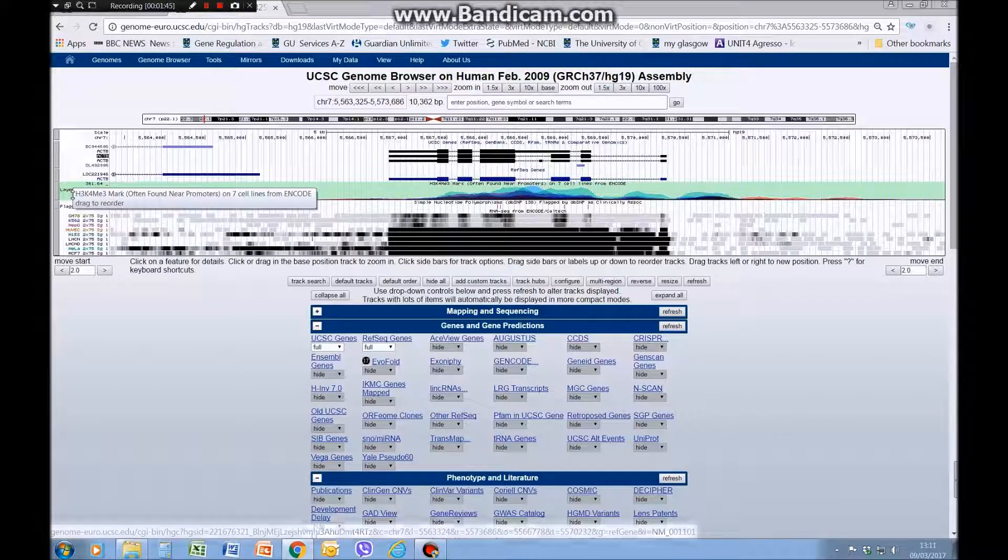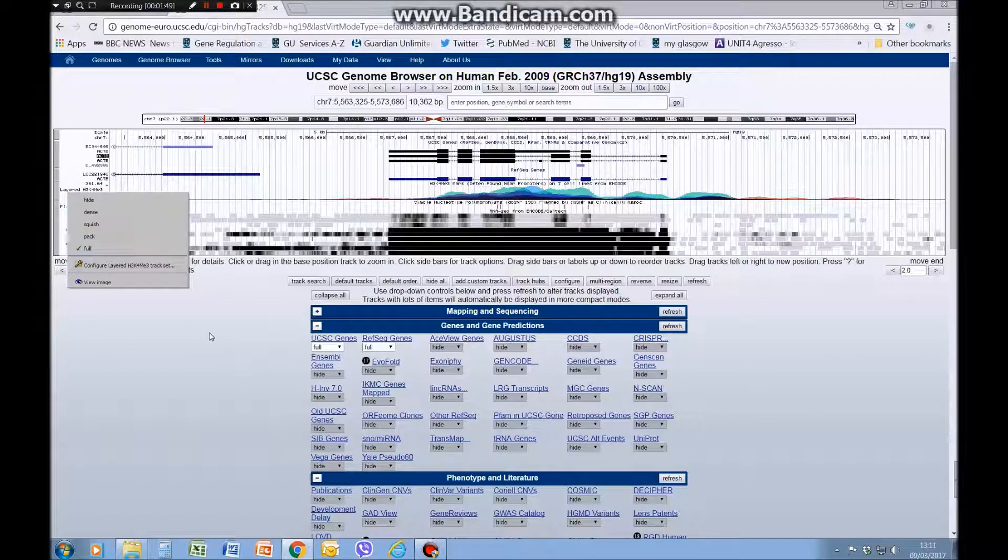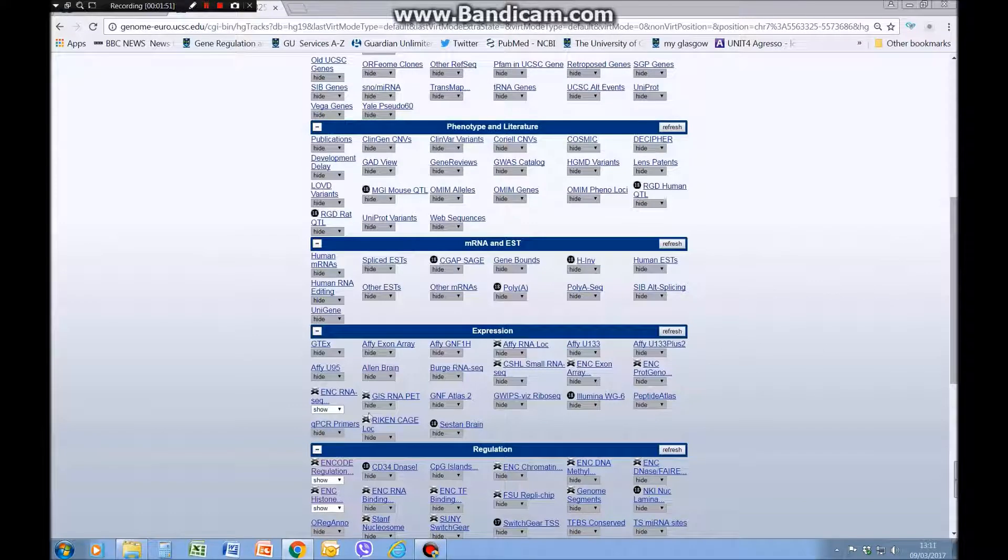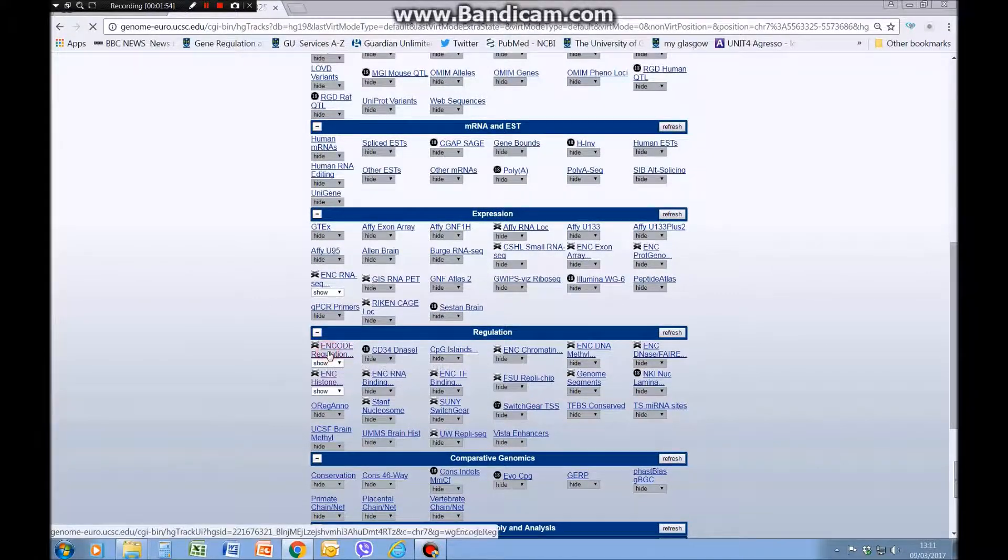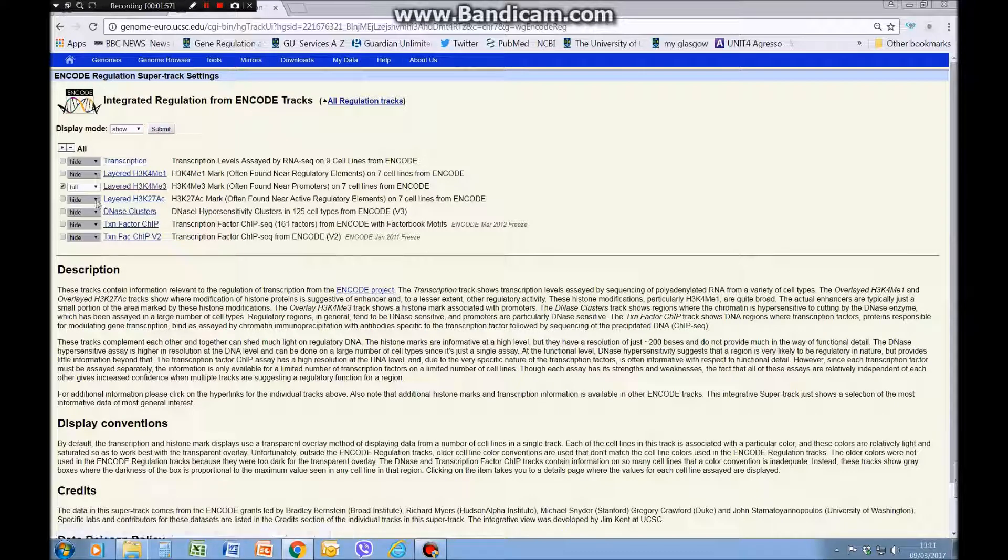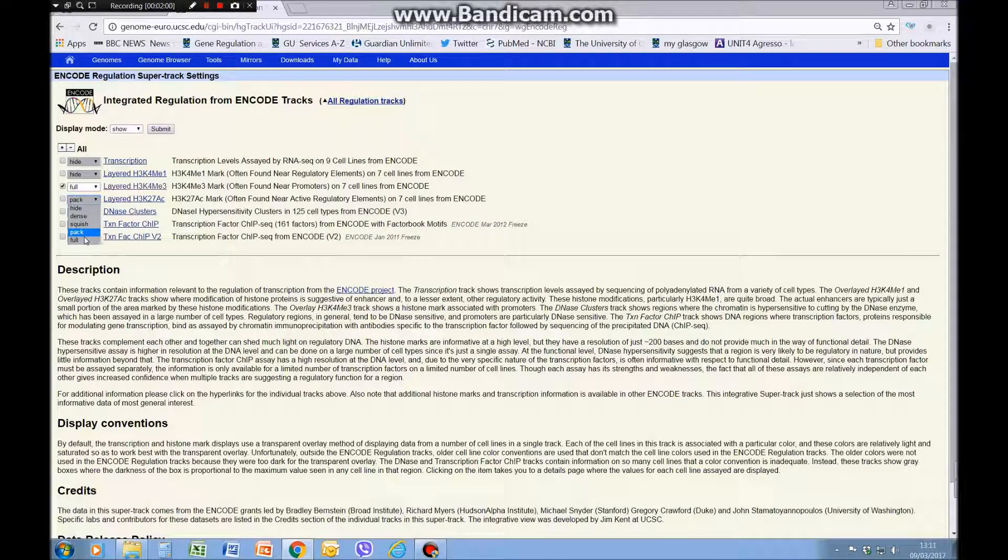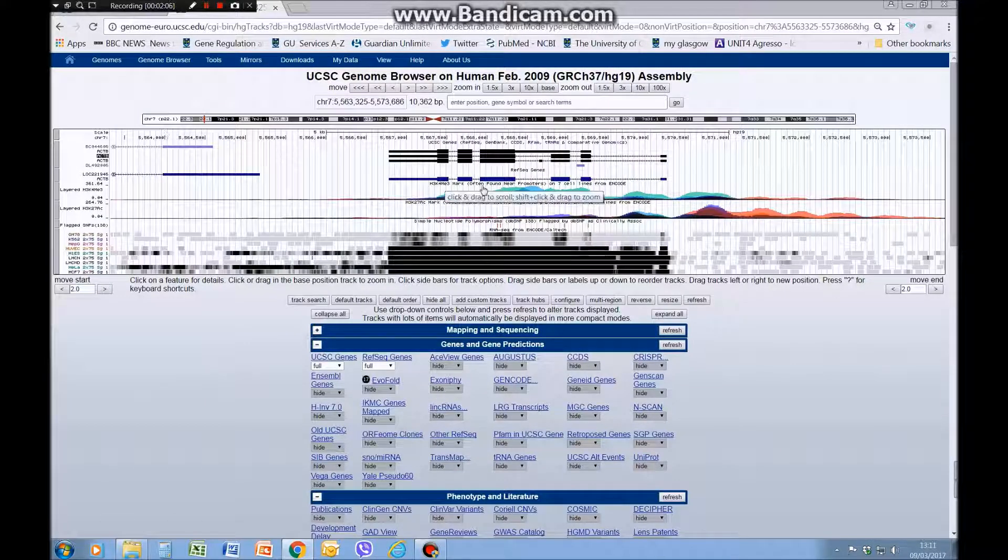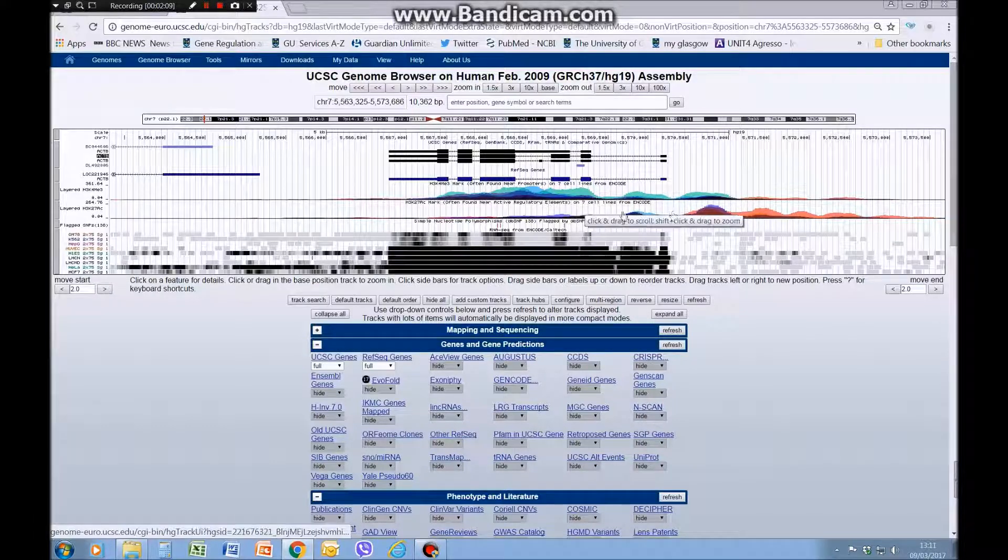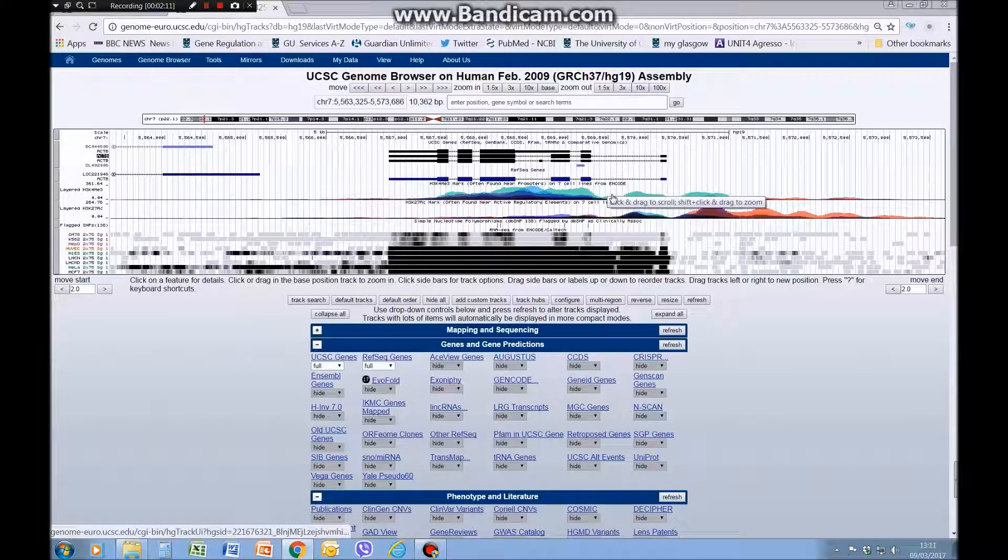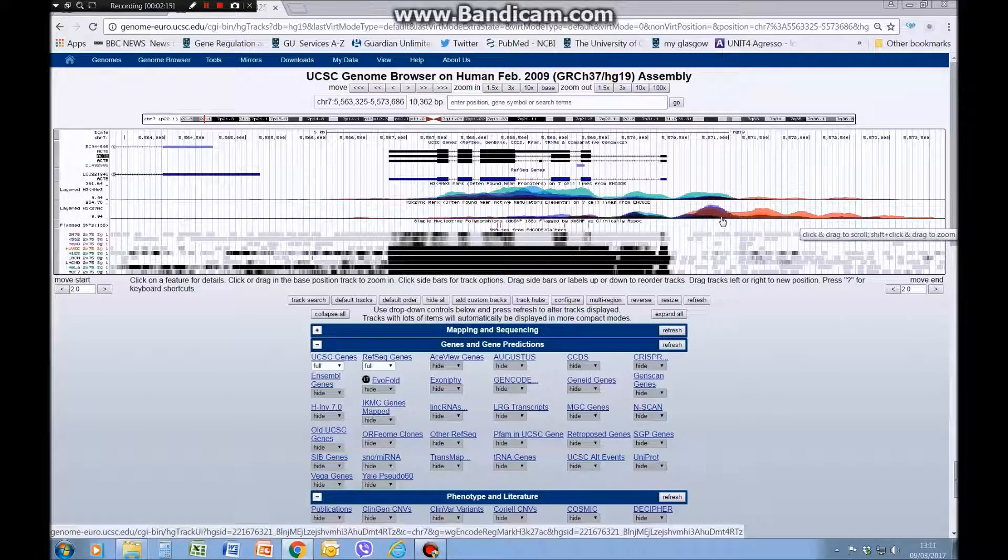We had wanted also to see the lysine 27 and we're not seeing it, so we'll go back to that menu, ENCODE regulation. Oh we've lost it, so we're going to click that full, turn that on, submit. There we go, so now the lysine 27 acetylation is in a slightly different place. There's some overlap with the lysine 4, but we also see it in different places.